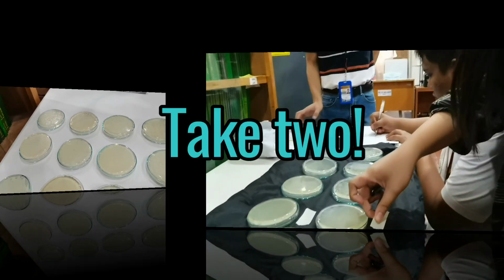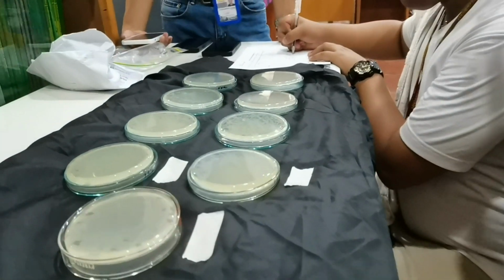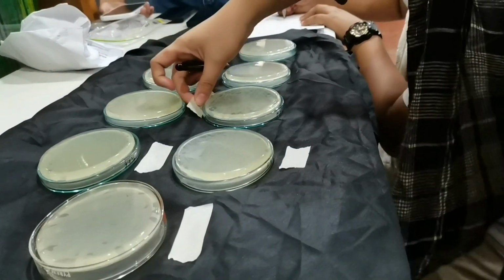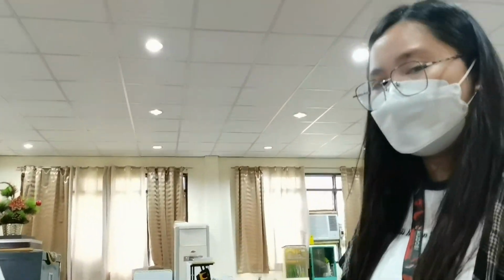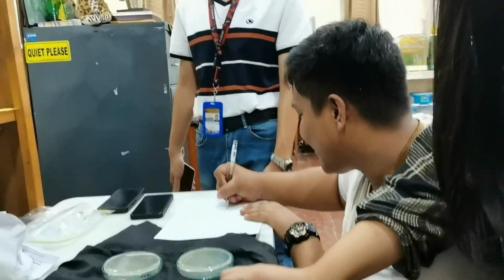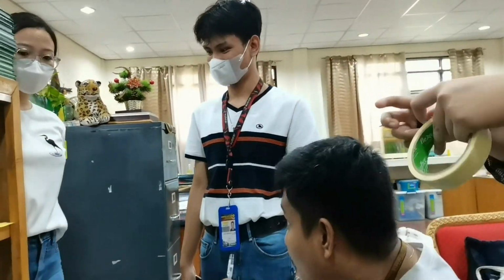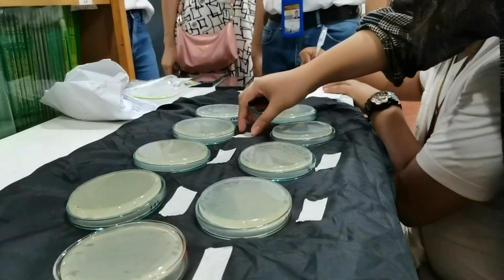Okay? Here we are after repeating the experiment and making modifications. So Daphne, Kyle, and Lloyd are here, and Melanie as well. We are rejoicing.